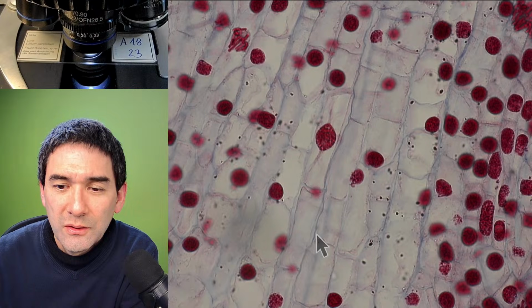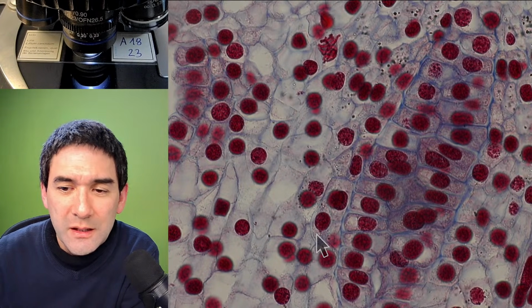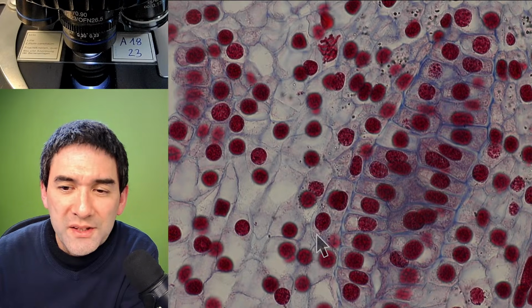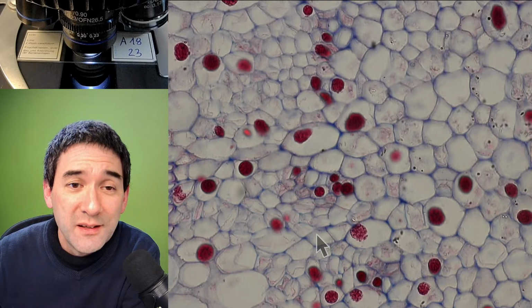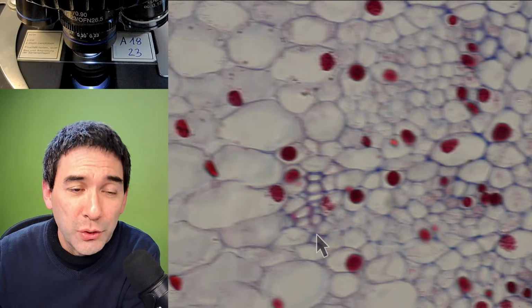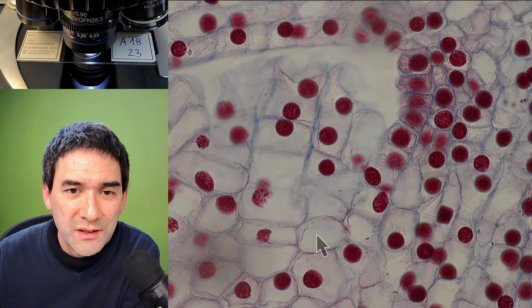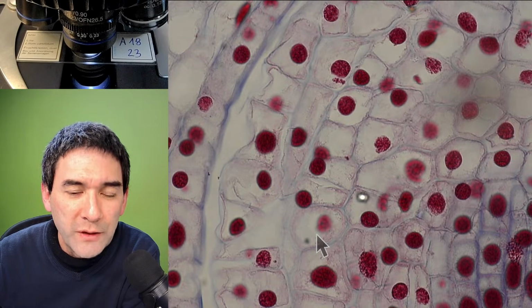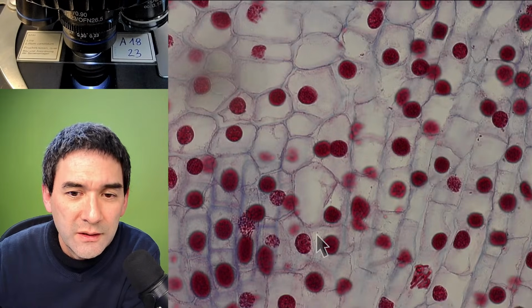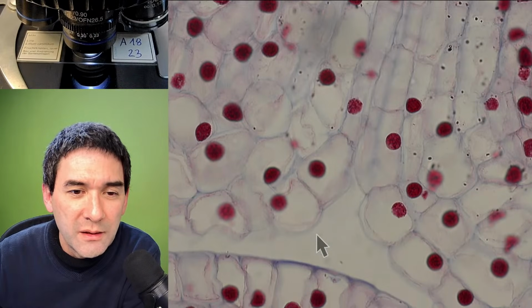Fetal development is a long sequence of emerging properties dictated by gravity and chemical concentration gradients. Yes, and it's a complex process. They've been studying developmental biology also on fruit flies and Drosophila. Here again, you see that's one of the nice specimens.